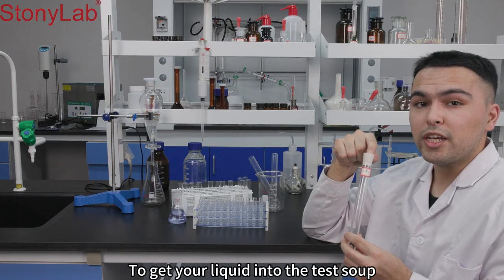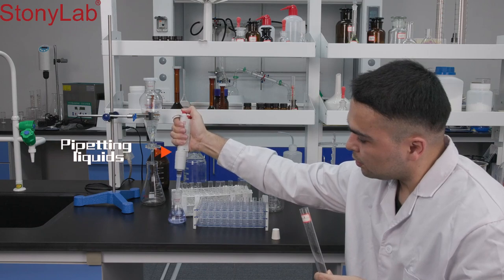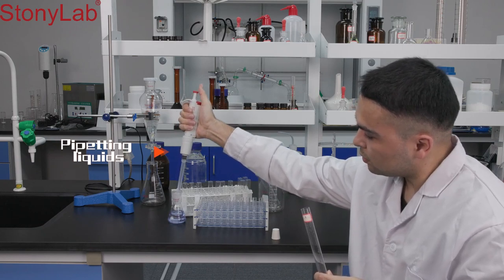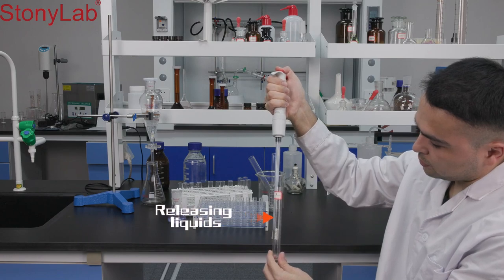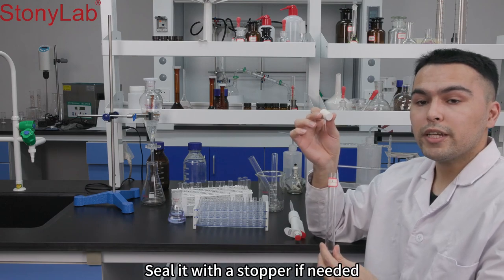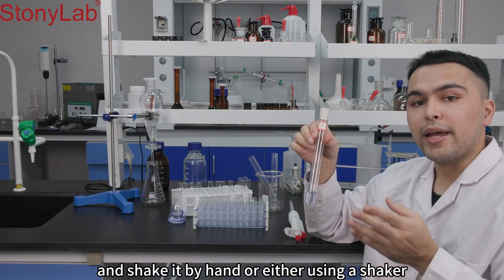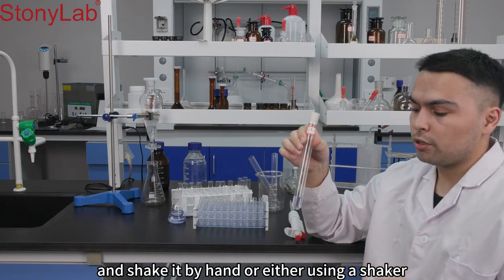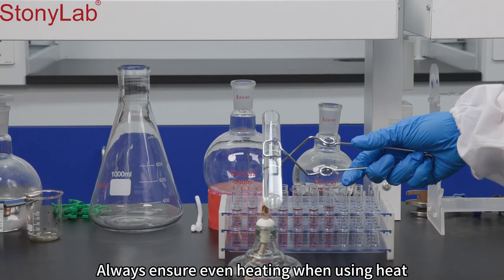To get your liquid into the test tube, use an appropriate pipette. Seal it with a stopper if needed, and shake it by hand or by using a shaker. Always ensure even heating when using heat.